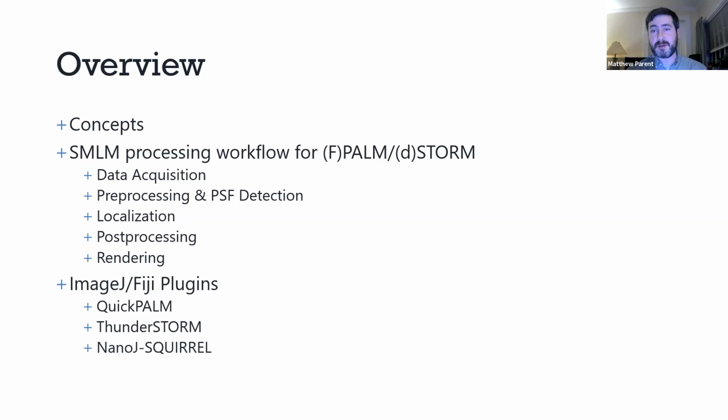It's fantastic if you know how to program and you can do a lot of these image processing things on your own, but of course not everybody can program and not everybody wants to program. It's a very useful skill, but there are a lot of pre-built software packages that are free, open source, that you can use to analyze single molecule data. So I'll show you how those work, and some things to watch out for, but I'll talk more about that later.